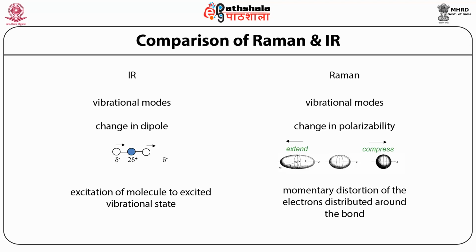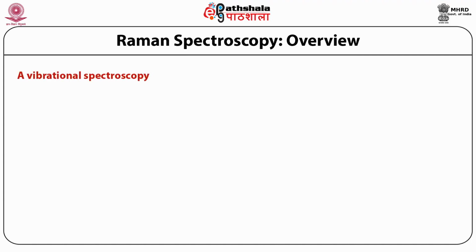Point 4 in IR is asymmetric vibrations. These are active, and in Raman these are symmetric vibrations. Those are active. An overview of Raman spectroscopy.